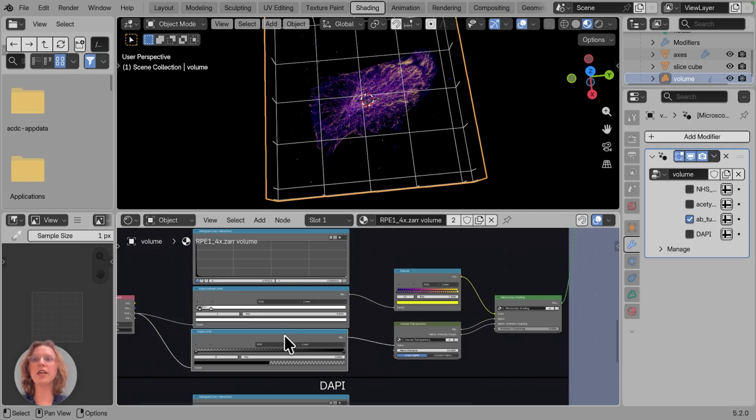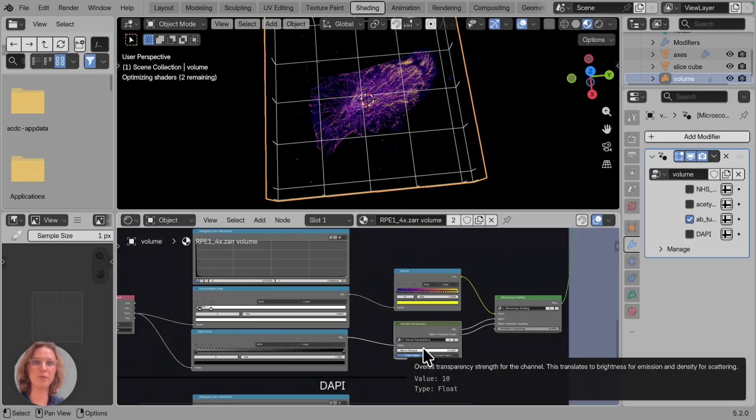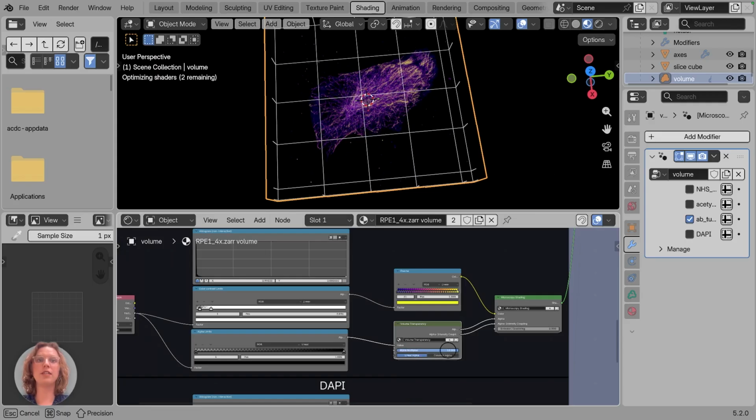Additionally, outside of just the range of alpha, for the min and max, we also have a block to change how the alpha is being interpreted. Here this contains a multiplier, which is how intensely every voxel will contribute to the final render. So in an emissive render mode, this means how much light it gives.